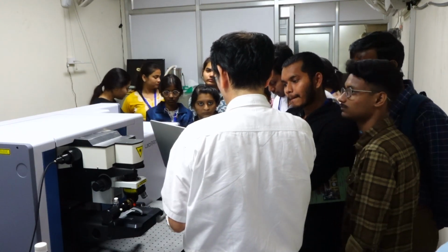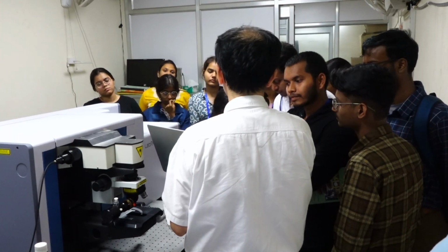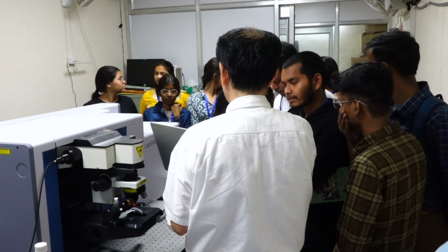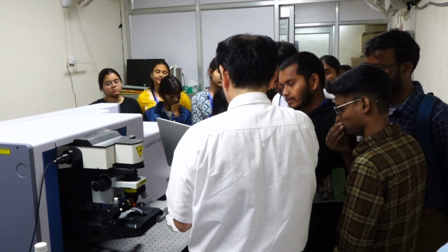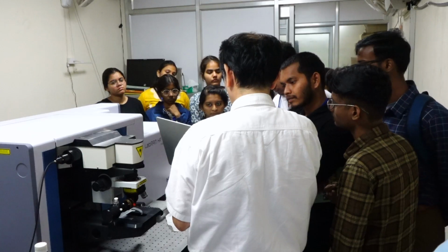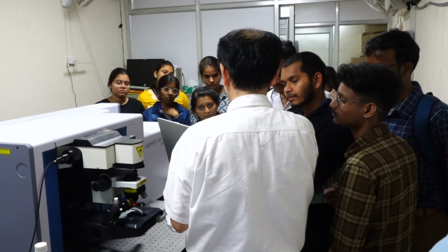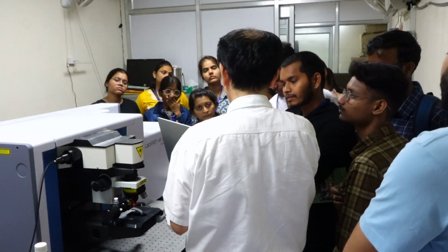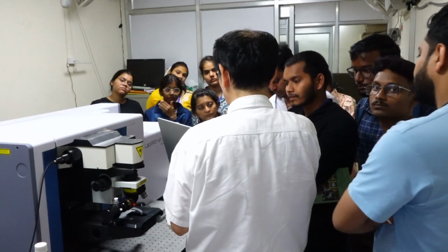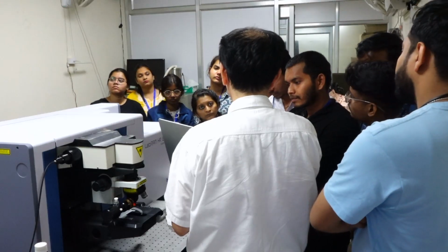If the molecular structure is different, the vibrational mode is different, then the frequency becomes different. So the peak position is different. There are no two different compounds that give exactly the same peak intensity pattern. So it's unique. That's why we call it a fingerprint.